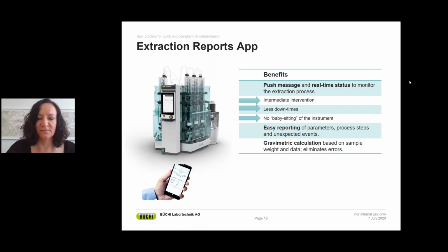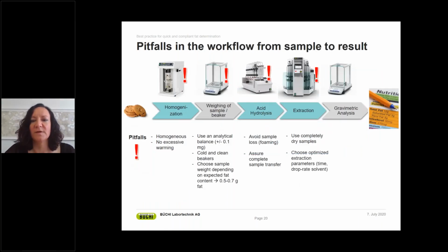So we're almost at the end of our extraction process. We finally have to weigh the sample, the fat that is extracted in the beaker. So this we also do on an analytical balance. And here it's also important that you weigh only dry and cold beakers.